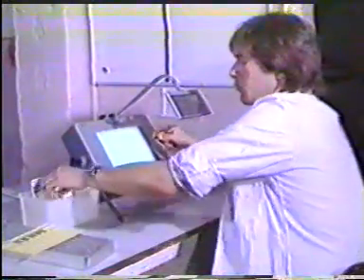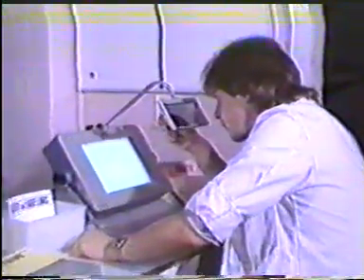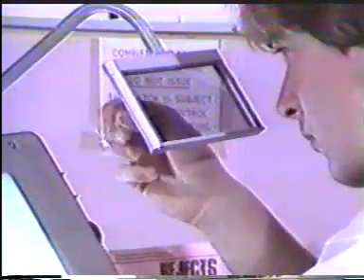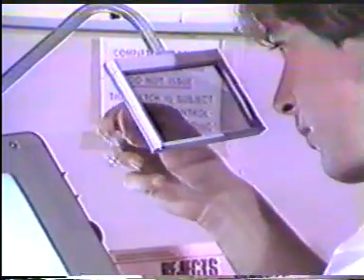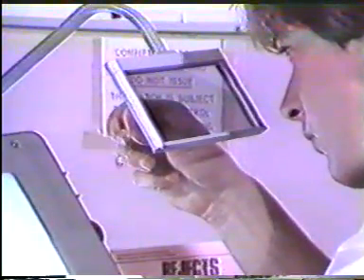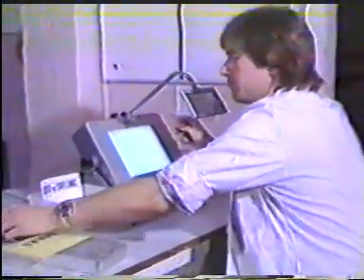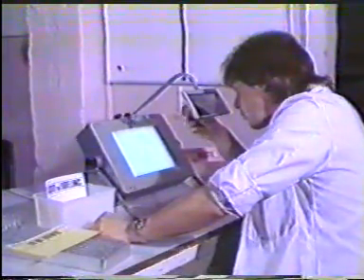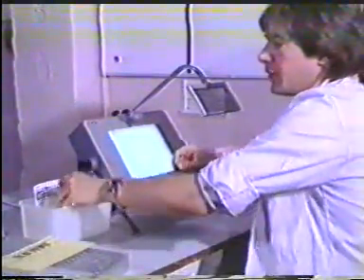Viewing of injectables for particles is an important stage in the manufacturing process. Preparations for injection should not contain any particle visible to the naked eye when viewed under polarized light. Any containers in which particles can be seen are rejected. Less critical, but still important, is the viewing of ophthalmic drops or sterile topical fluids. It is also desirable that non-sterile products, such as ointments, creams, or mouthwashes, should not contain any discernible particles or foreign bodies. Any that are unacceptable should be rejected.